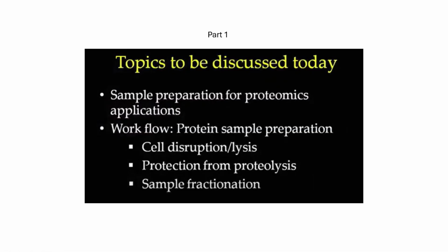So coming to week 2 lectures, I just wanted to give an overview of how proteomics can be studied. Before doing everything, we need to have a sample. We need to know the source of the sample. How can we collect those specific protein samples, and how can we extract proteins out of that specific sample? There are different methods for it, so we'll be dealing with sample preparation.